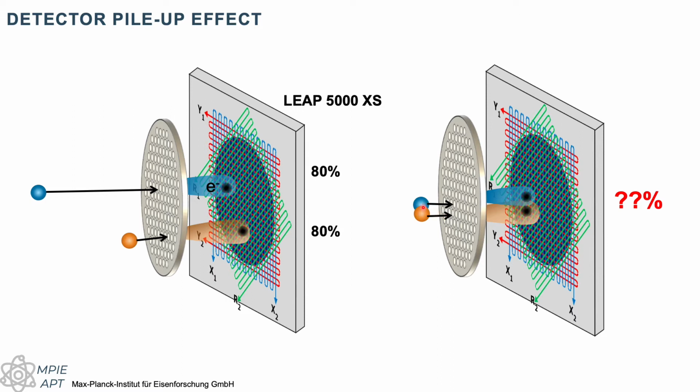Because I've told you we have to generate these signals, and then the signals must travel along the lines, and then we collect these signals, and we need to attribute to each ion a set of, in that case, normally 6 signals. But if the two ions strike very close on the detector, there might not be enough electrons to trigger, or it's just going to be one big electron cloud, so there might actually be issues.